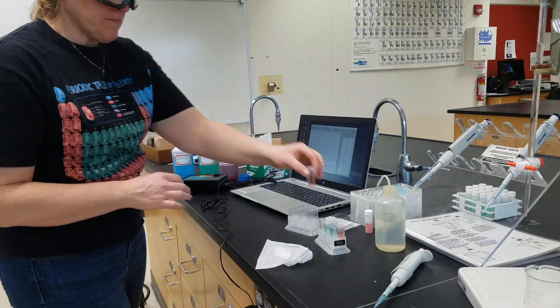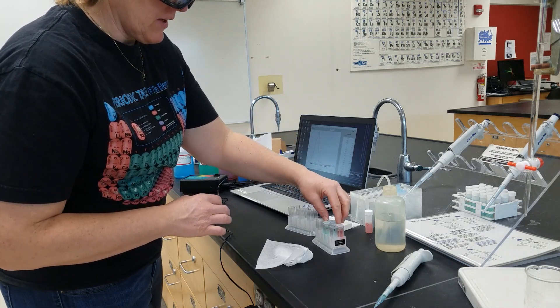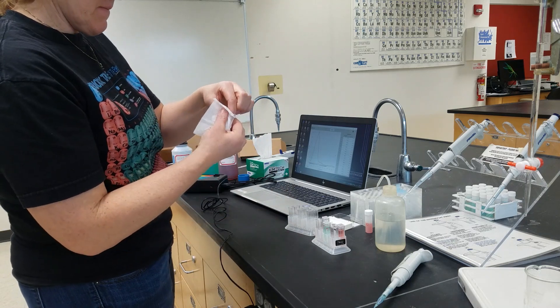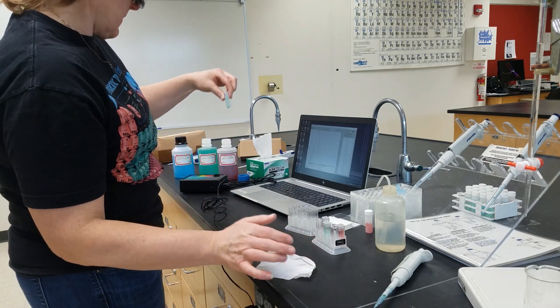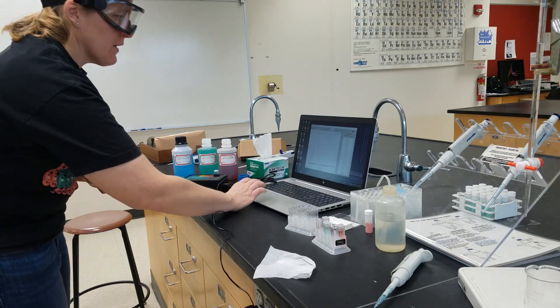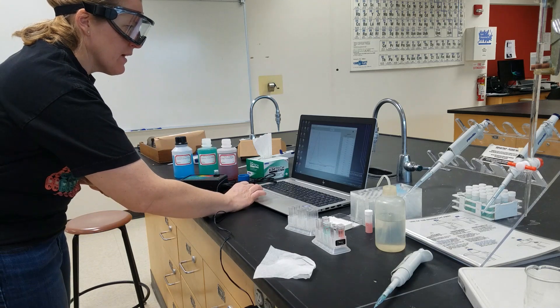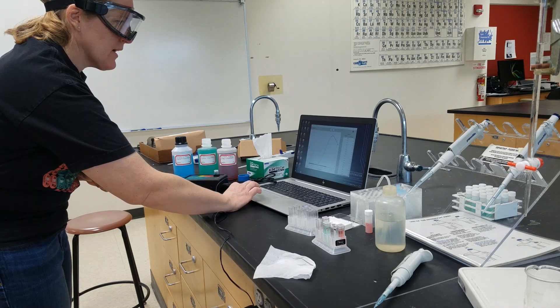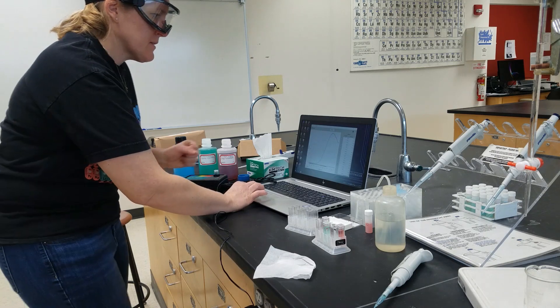We can take that out, and we can put in our copper nitrate. Put it in the path length of the light, and hit collect. And stop. And rename this data set.